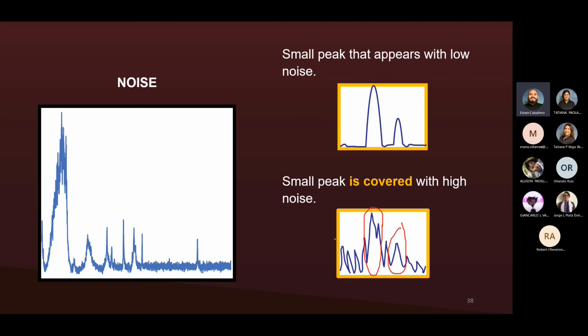You see them almost at the same level, so you basically even ignore the possibility of a peak being there. And this harms what's known as quantification and detection. You need the peak to be as clear as possible. If the peak is not clear, you cannot identify the molecule.